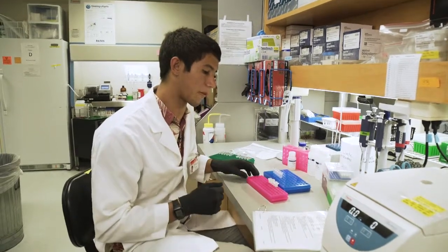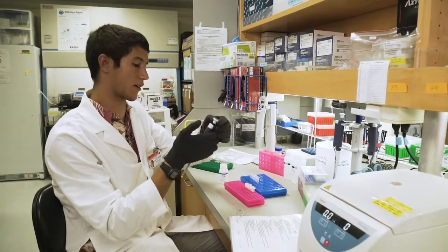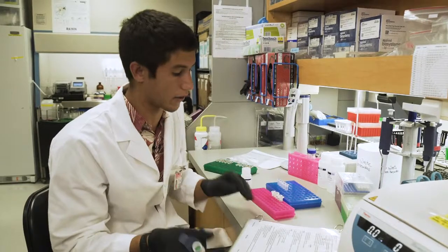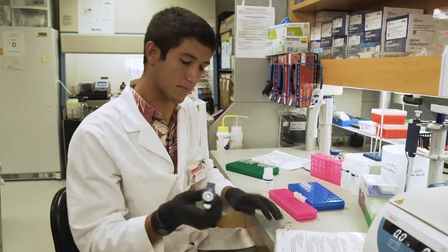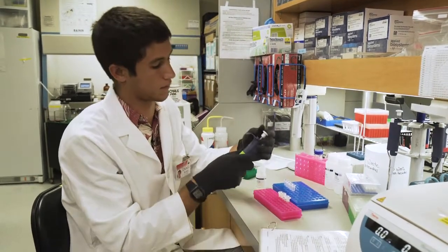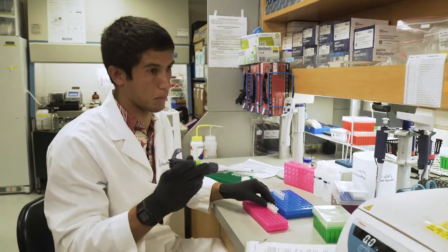So the first buffer we use is buffer AL, which is this guy. And we take one of these things over here called a pipette, or in particular a micropipette, or a pipette man. For most science and most things in this lab at least, we have a detailed protocol about what to do so that everything's standardized. So you always have your protocol available to you, and they're laminated so they don't get wet or anything like that. You'll see me referring to that many times, just double checking, because there are a lot of steps and you can easily get mixed up if you aren't being careful. Our pipette man is used for measuring out very small quantities of water, or any liquid really, and then pipetting them or moving them.